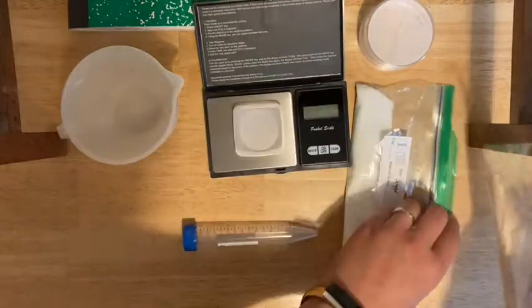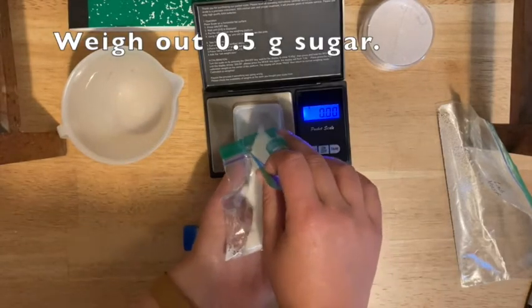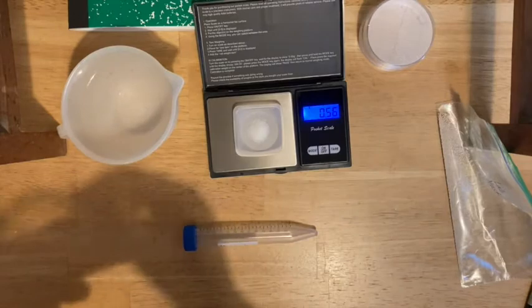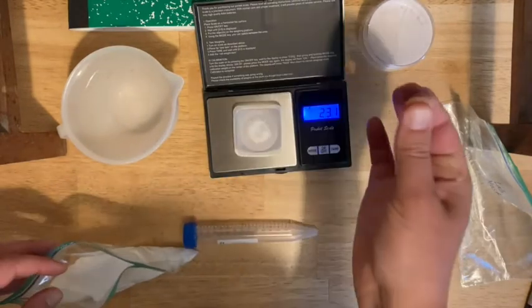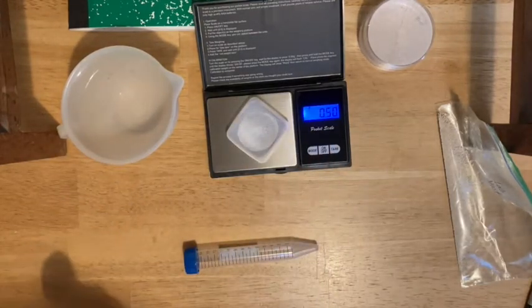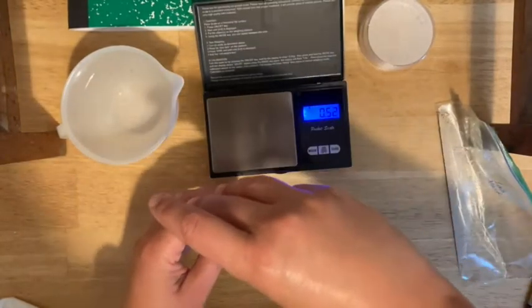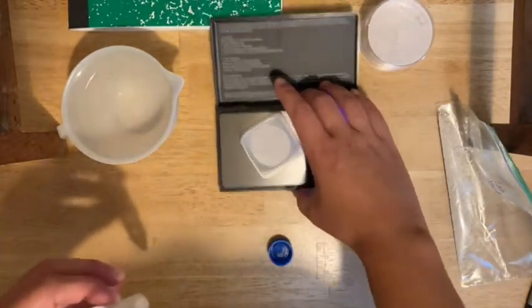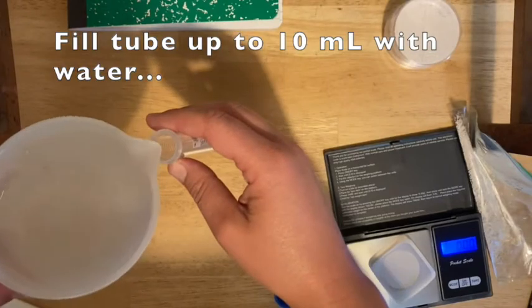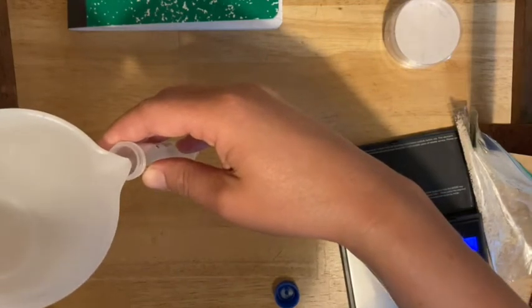Start by weighing out the sugar. Make sure you zero the balance with the weigh boat on it. Try to be as precise as you can — if you get a little over, just throw a little bit out. Once you get to the right amount, put it into the tube and try not to spill. Fill up to the 10 ml line with warm water — it can just be tap water. Make sure you don't go over 10 ml, so go slowly.